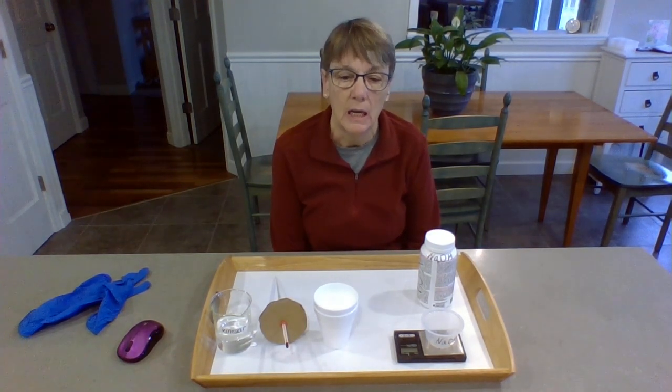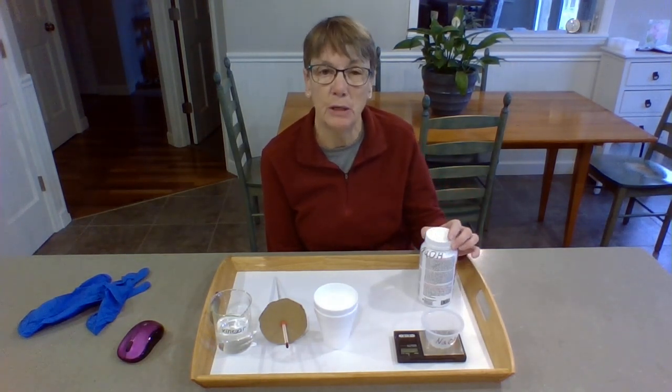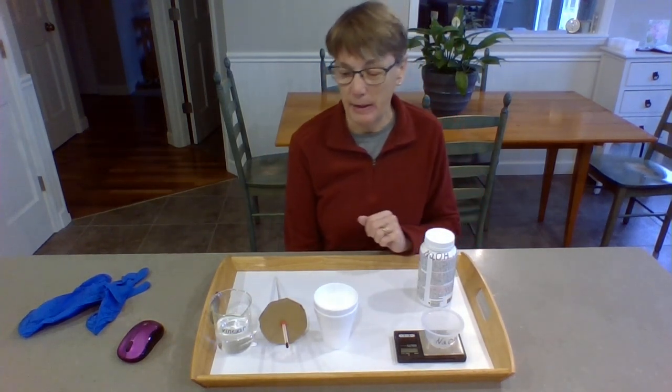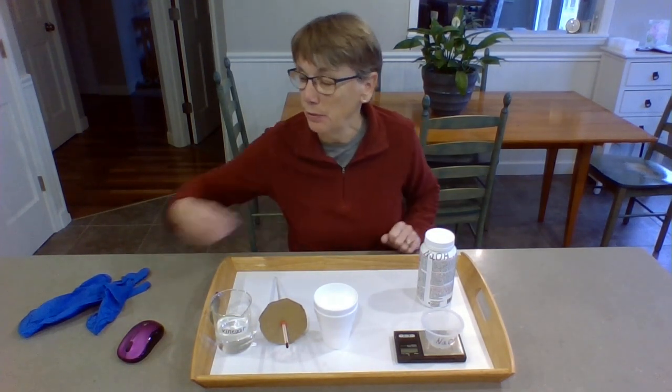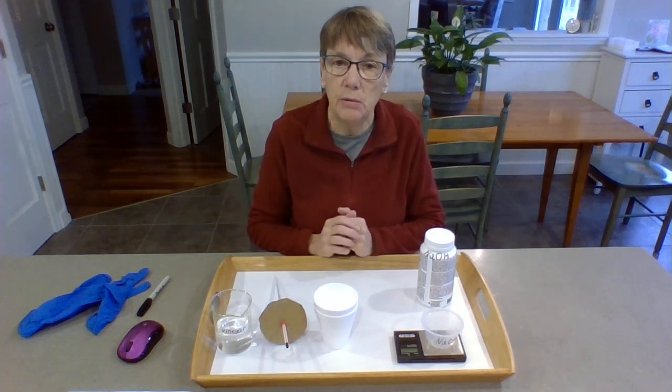What I'd like you to do is take the numbers that I am actually using to do your calculations. This is not a good experiment to do at home by yourself because we're going to use sodium hydroxide, which is caustic to the skin, and you might not have any at home anyway. So I'm going to do the experiment. I am going to tell you the measurements as we go through, and you can record those. You can start and stop the video whenever you want if you miss anything.